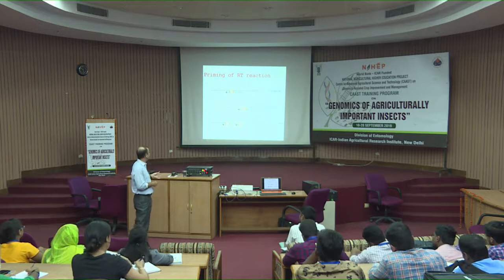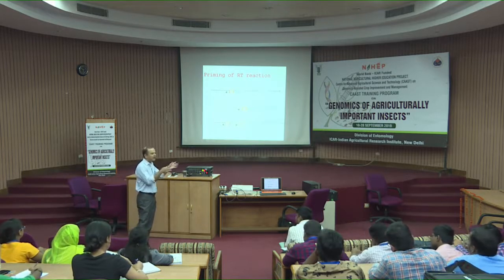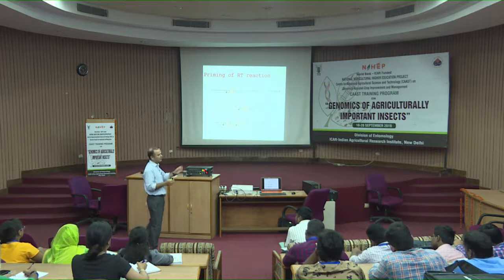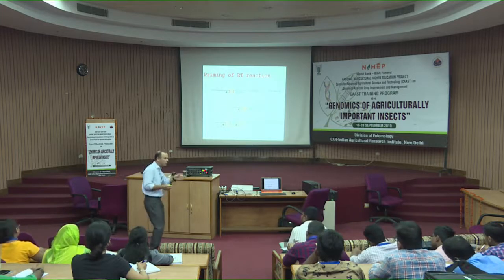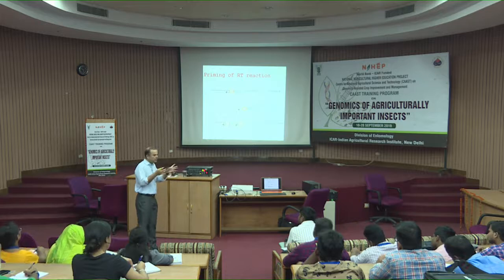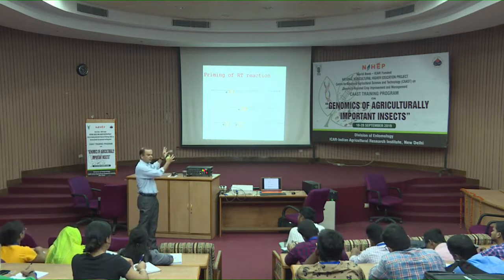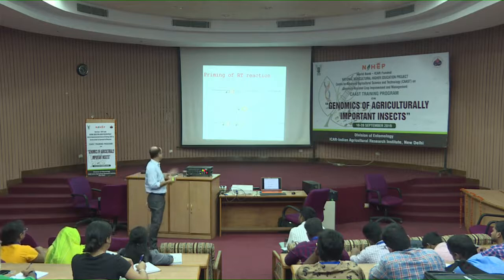When that is added, they will find their complementary sequence here and there across the mRNAs at different regions, and wherever they bind, they do synthesis. So, you get a population of small pieces of cDNA, but that will represent your mRNA population. So, that can be used further.